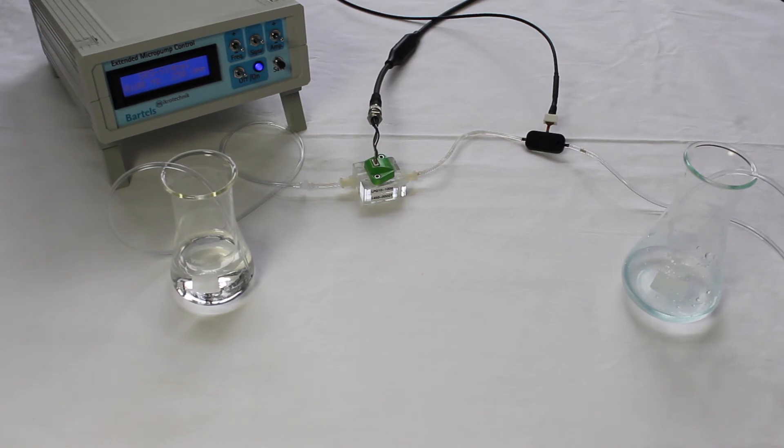With maximum amplitude, the pressure generation of the pump is the same as without the restrictor. If you change the amplitude in such a system now, the pump curve will again be shifted in a parallel way.